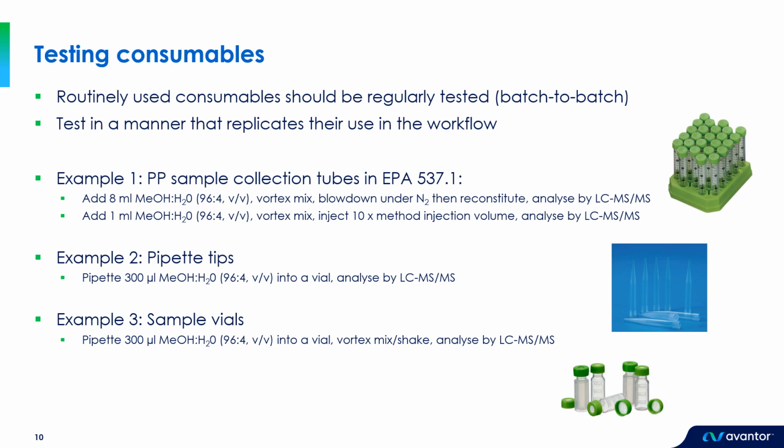It's important to note that the term PFAS-free can be a bit misleading because we typically test for only a small subset of PFAS. When we say something is PFAS-free, we basically mean we can't detect the specific PFAS we're looking for. There could, of course, be other PFAS present that our LCMS method doesn't pick up.